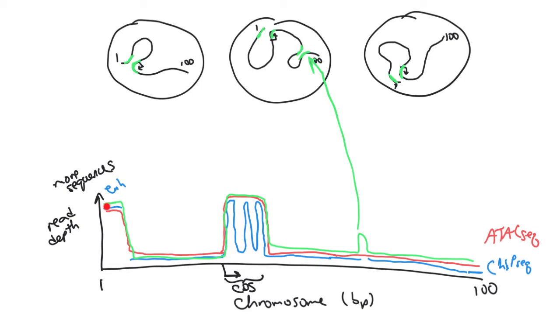So if we see a peak in any three of these techniques, ATAC-seq, ChIP-seq, or 4C-seq, if there's no gene there, why would it be physically close to another region of the chromosome and euchromatic? Those pieces of information together suggest, they don't prove, but they suggest that that region could contain an enhancer.